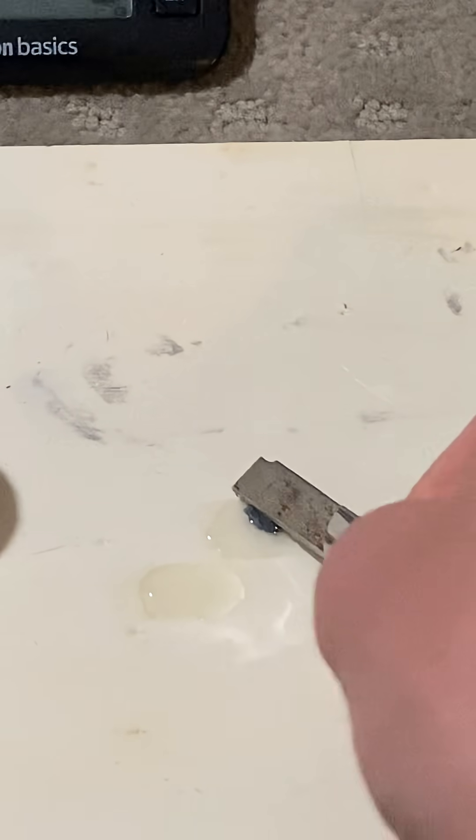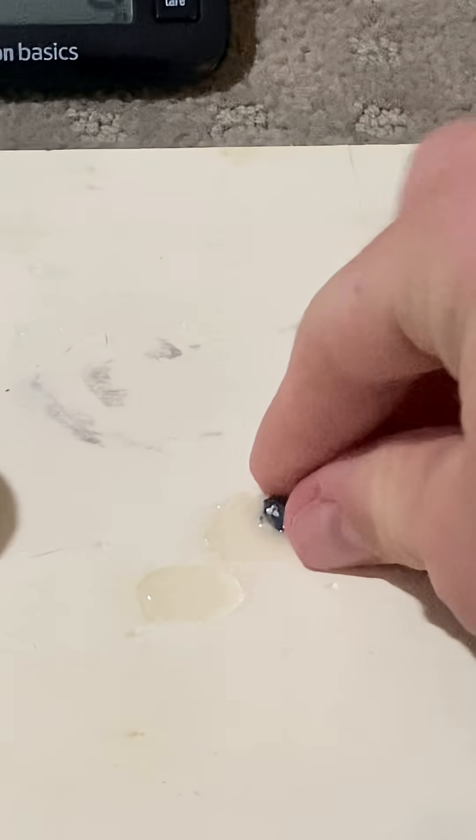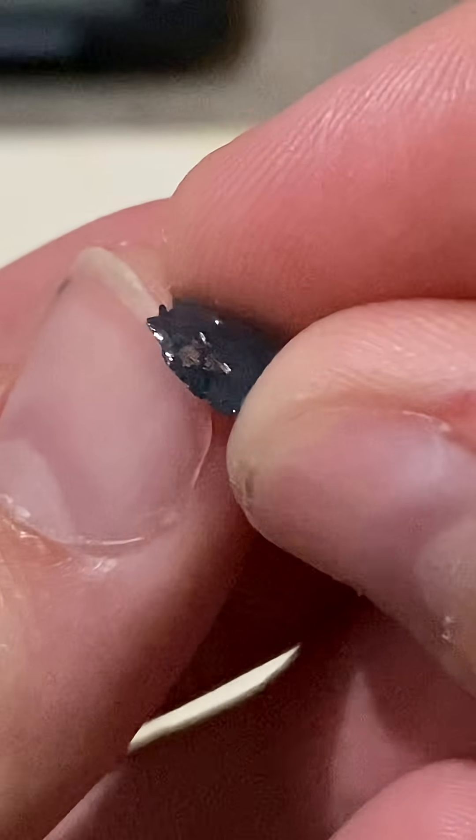We're going to try cutting it. You can see — look how shiny that is. You see the shiny metal on the inside.